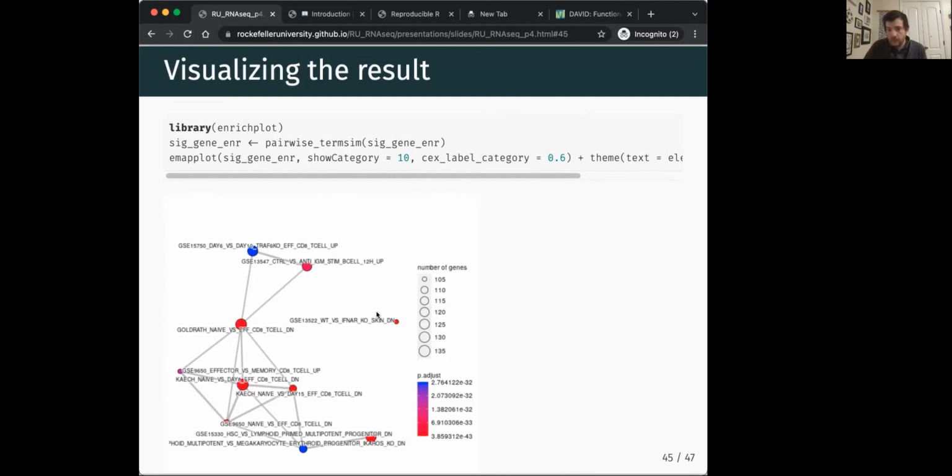Okay. And so Wuji has a question: do you have any suggestions to deal with genes with the same rank? Okay, so it happens occasionally that your statistic score, or whatever score, might have exactly the same value. It's rare, but it does happen. There's a control within the GSEA function, I believe. Let's see.